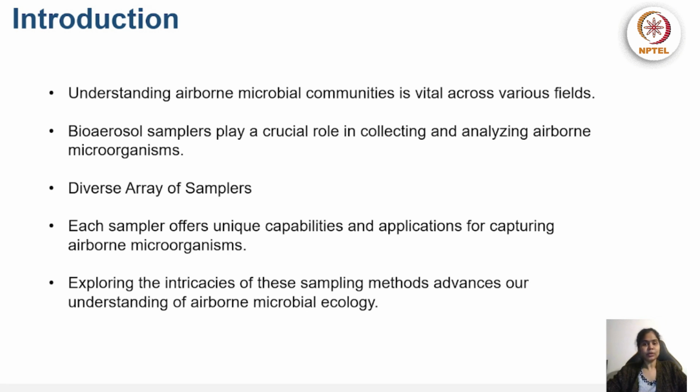So it's important to explore these samplers, and we should understand how their sampling efficiency changes based on the environment. Why is it important? Because when we talk about sampling and analysis in aeromicrobiology, especially in bioaerosol sampling, so far there is no standard protocol or no single recommended sampler available. So it's really tricky to choose which sampler to use or which analytical technique to use to characterize the bioaerosols.